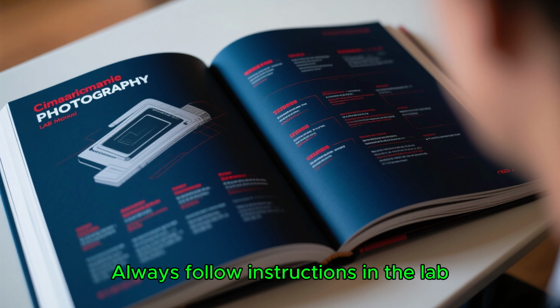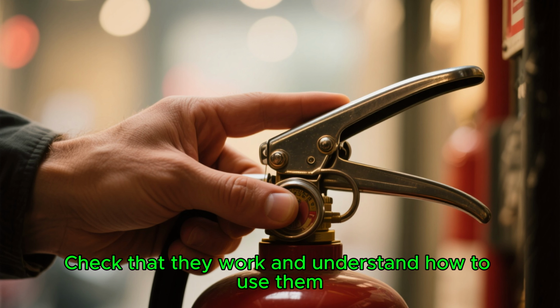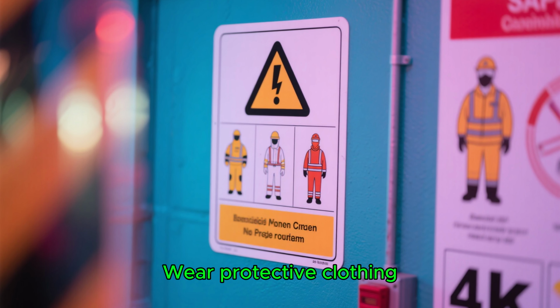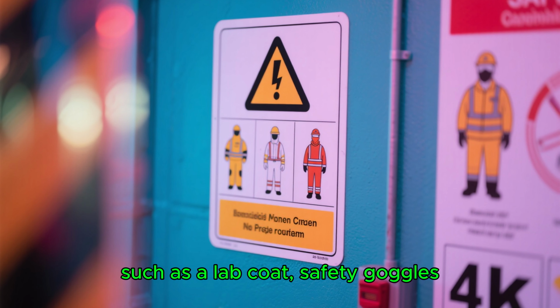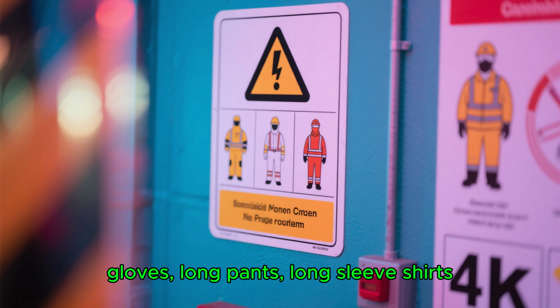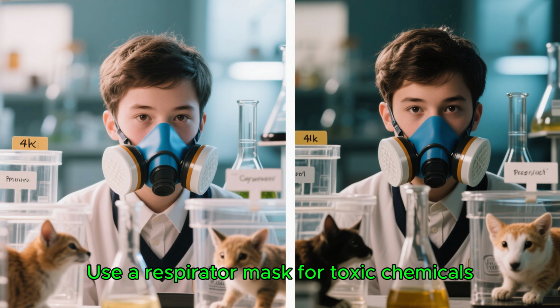Always follow instructions in a lab. Read and understand all steps of the experiment before starting. Learn how to use lab equipment properly. Know where safety equipment like fire extinguishers and first aid kits is located. Check that they work and understand how to use them. Look for safety signs before beginning. Wear protective clothing such as a lab coat, safety goggles, gloves, long pants, long sleeve shirts, and closed-toe shoes. Use a respirator mask for toxic chemicals.